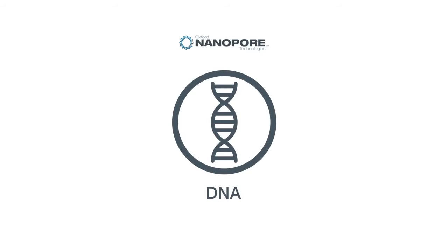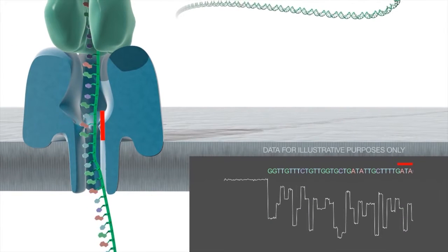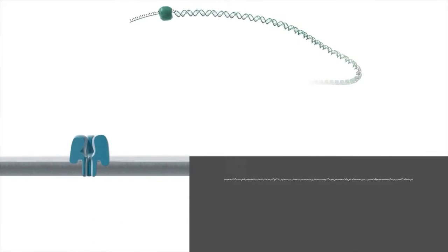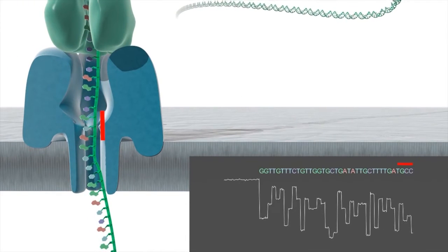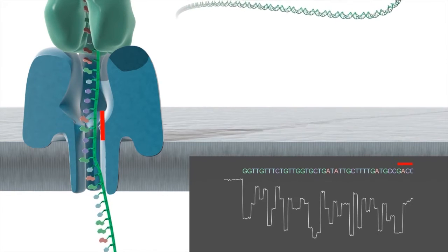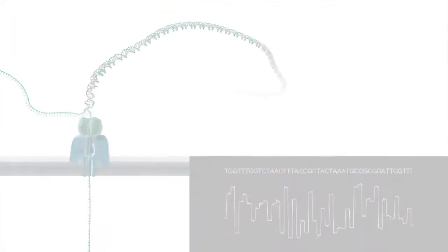For DNA sequencing, Oxford Nanopore uses a strand sequencing method, in which intact DNA strands are processed by the nanopores and analysed in real time. The nanopore sequences whatever fragments are presented to it, regardless of their length, rather than generating reads of a specific length. This is different from traditional cyclical sequencing chemistries that deliver a set of data at the end of a fixed runtime, with fragments of a set length.